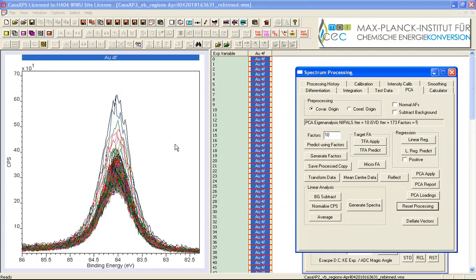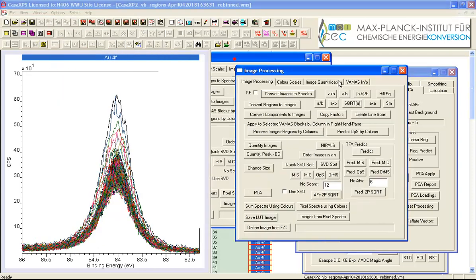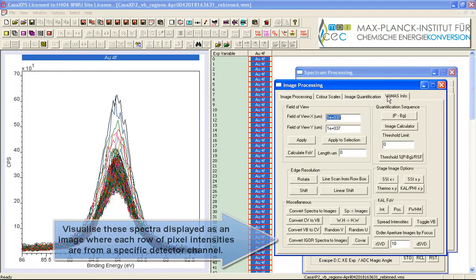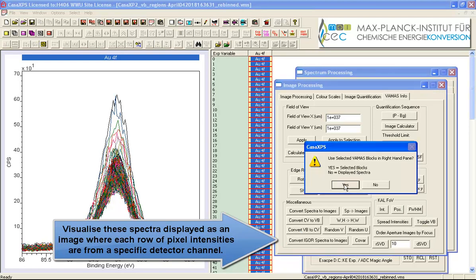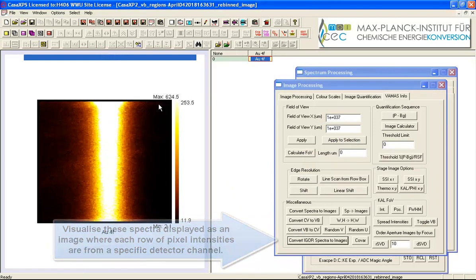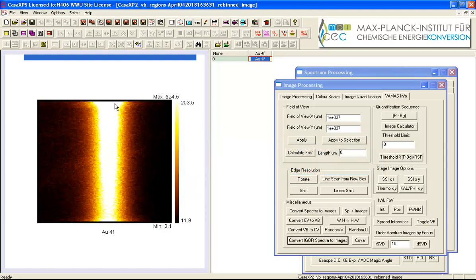So I'll reset these data and I'm now going to use an option on the image processing window which also requires the data channels to all align just as I did with the principal component analysis and that's on the VAMAS info page and I'm going to convert these spectra to an image. And that's an image of this gold 4f 7.5 peak so you can see how the data varies as a function of the detector. So the image provides an impression of how the intensity and the position and the full width half maximum varies as a function of the detector.